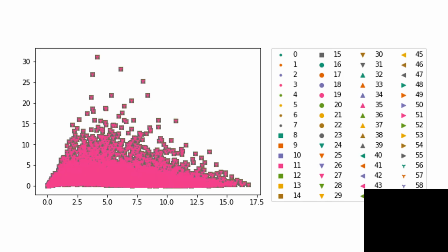Next, I conduct a preliminary analysis to understand if there are important biological differences between our two data sets. This is important because if we don't see easily recognizable differences between our two data sets, it may not be a great data set to explore. So this scatter plot is a plot of mean gene expression values versus the variance.